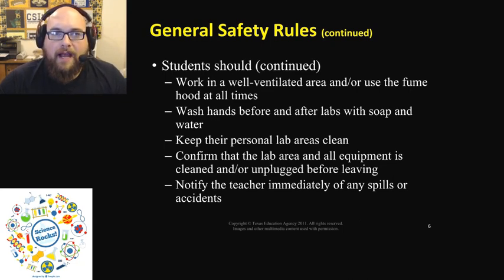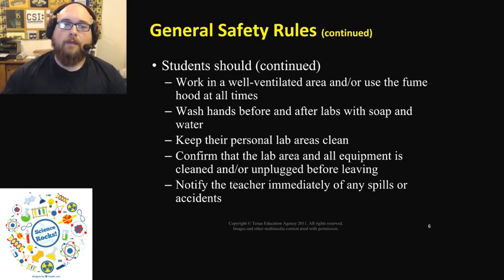We want to make sure that we wash our hands with soap and water to keep them clean and get anything off of them at the end of the lab. For instance, if you go to lunch with chemicals on your hand, then that chemical will get into your mouth and could cause you to get sick. We want to keep our lab areas clean. Before we leave, we want to make sure that the lab area has been picked up, organized, and that all the equipment is properly unplugged. If there's any accident or spill or break in anything, even scratches in some equipment, please notify the teacher, which is going to be me, so that we can handle that and check it for its safety.